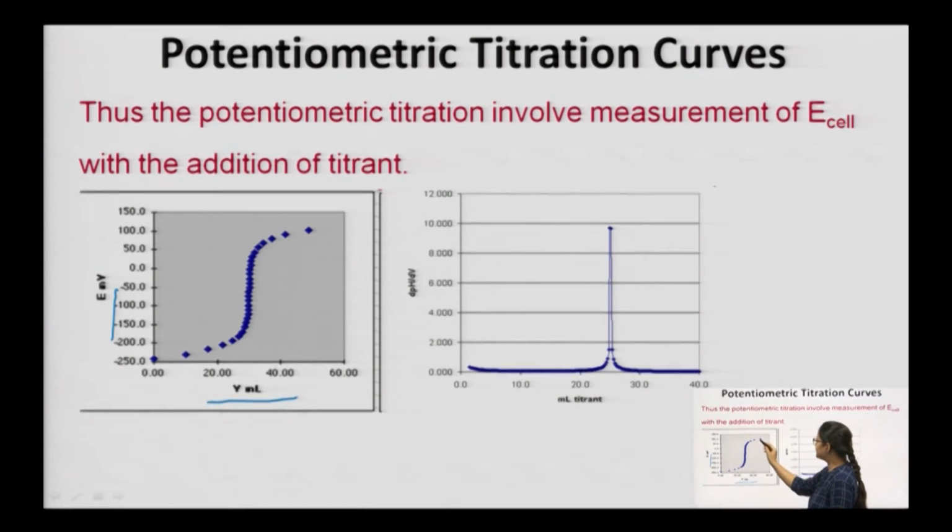As you can very clearly see, we will get a sigmoid shape, S-shaped graph. This is a potentiometric titration curve or potentiometric titration graph. As you can see in the graph, when the reaction commences, when you start the titration, it remains flat. As the reactants react with each other, the metal ion concentration changes very slowly. So the graph remains flat as it approaches the end point.